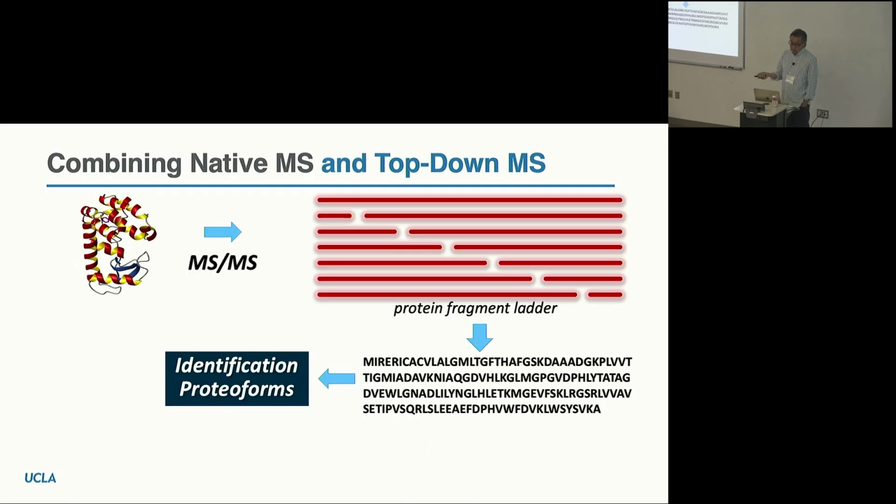Well, I'm going to resort to top-down mass spectrometry. I'm not going to give it to the NMR people. I'm going to try to see if I can do this by top-down mass spectrometry. So this is your intro to top-down mass spectrometry. No enzymes. We just go straight from the mass spectrum of the protein to fragmentation. We're using the methods that Josh talked about earlier this morning. Same methods, either collisions, electrons, or photon-based dissociation methods. We produce fragments of the protein, and these fragments can be matched to a putative sequence.